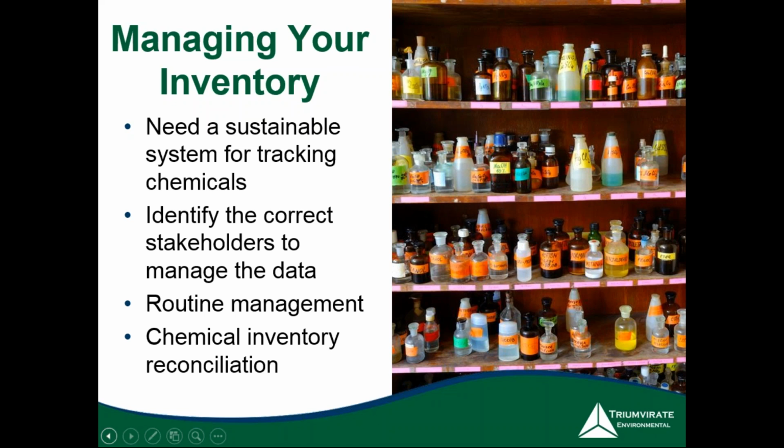But one last thing on this slide: when you're identifying the correct stakeholders to manage the data, I just want to make sure that everyone remembers that whoever you pick to help you manage this data and these chemicals should be trained appropriately.